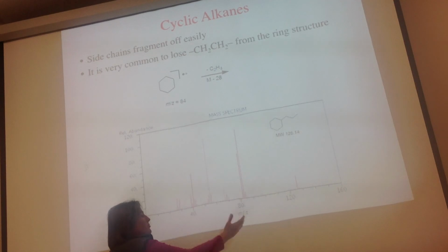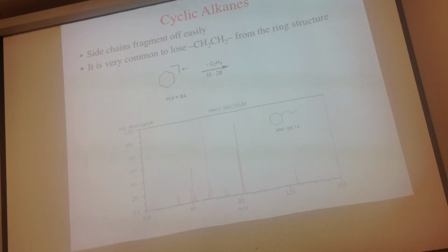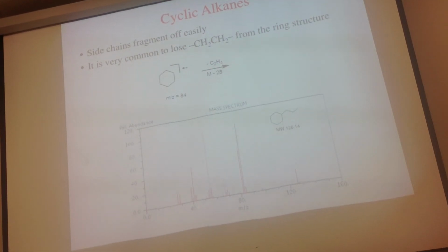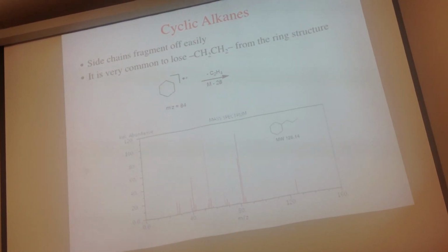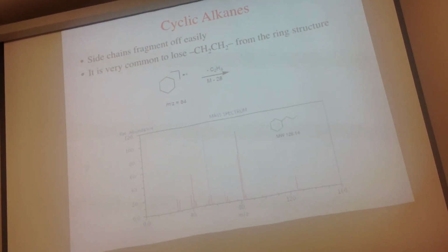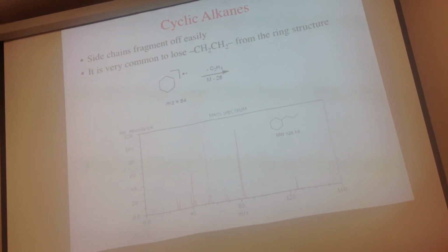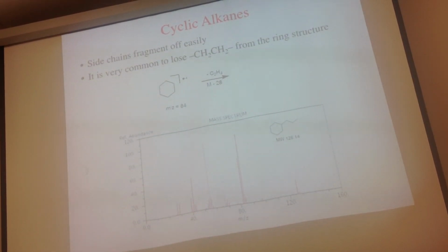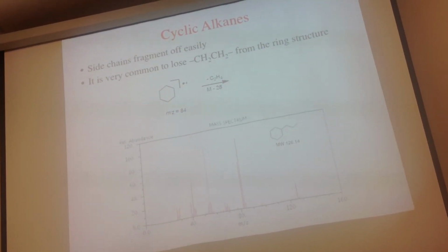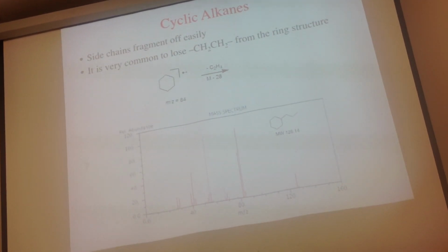This piece is where you broke off the side chain and then ripped out the CH2 from the ring. Okay. That one will have two pieces then? It would be fragmented into 3 pieces, exactly. Yeah, okay. Yep, it fragments into 3 pieces total. So, let's see. I guess that's about it. What about the piece at 40? What else is there? 42, 43. What do you think that is? Side chain. That's a side chain. Yeah, it is fragments. Okay.